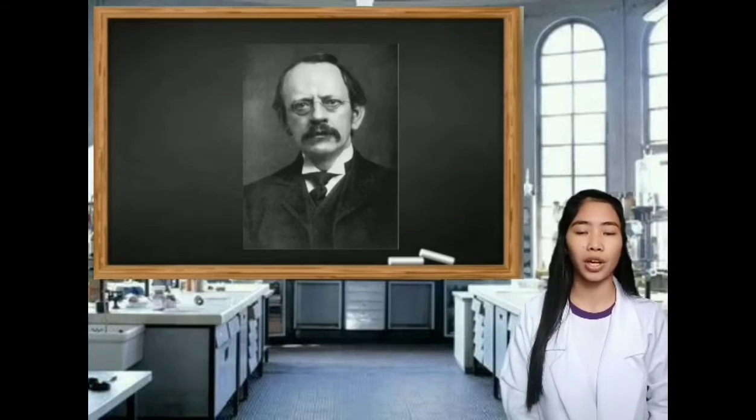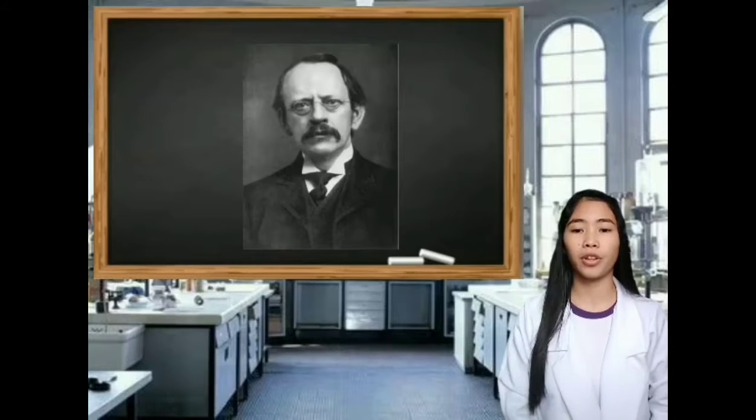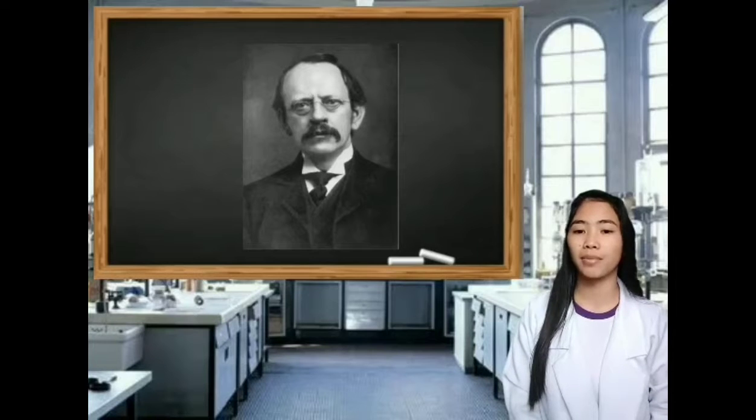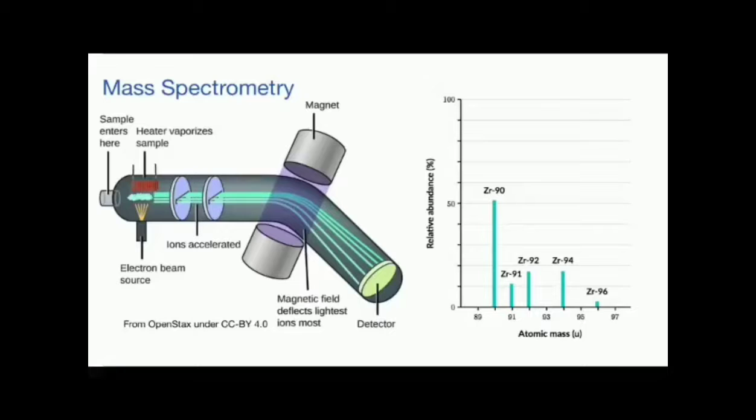The two fields in Thomson's tube were situated so that the ions were deflected through small angles in two perpendicular directions. The net result was that the ions produced a series of parabolic curves on a photographic plate placed in their paths. This is the reason why J.J. Thomson is credited with the construction of the first mass spectrograph and first mass spectrometer.